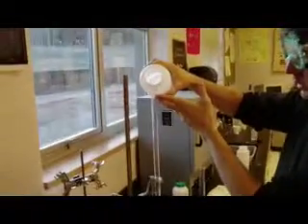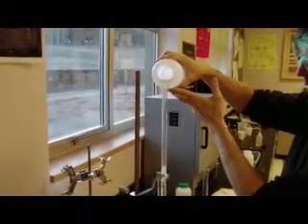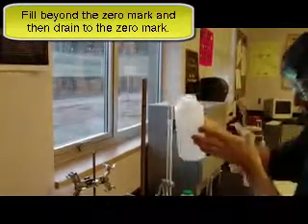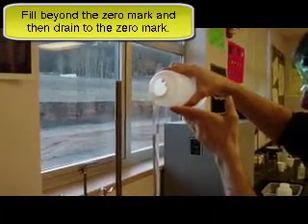I'm going to get my reaction container out of the way. And I'm just going to fill this up to the top. Now hopefully I closed the stopcock down to bottom. I just realized I forgot to double check that. It is. Okay, good. Otherwise you're going to have stuff running all over the place. Now it's best to overfill just a tiny bit, and I'll show you why in a minute.